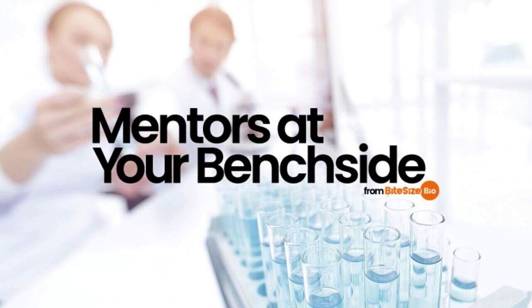What makes an analytical balance different from any other balance? Analytical balances are designed to deliver extremely precise results, as low as 1/1,000,000th of a gram. Therefore, they're often used for quality checks in the production processes of many pharmaceutical manufacturing companies. Analytical balances are greatly affected by their environment, how they're installed, and how they're handled. This is why it's important to assess the lab environment to make any required on-site adjustments.